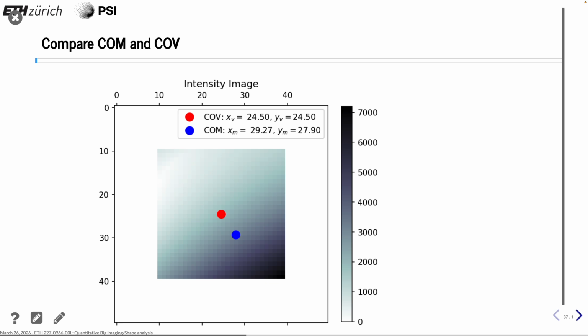In some cases, or in most cases, it's enough to just use the center of volume. If you have, for example, you want to get the centroid of some dots or blobs in the image. I have one example in my work where we want to identify reference dots in images, and the segmentation gives us some shape, but thanks to the illumination, this real center that we want to know is a little bit shifted. So then we use the center of mass to get the deepest center point in that image.